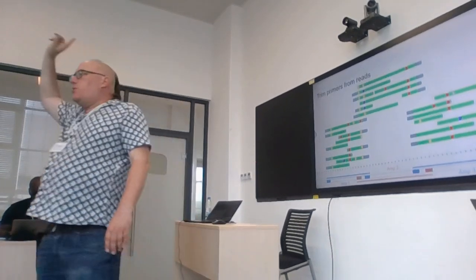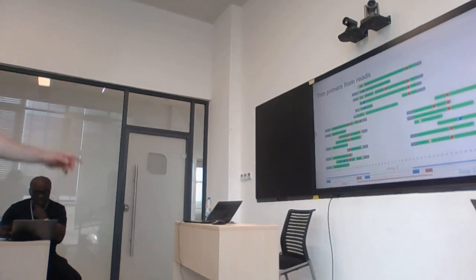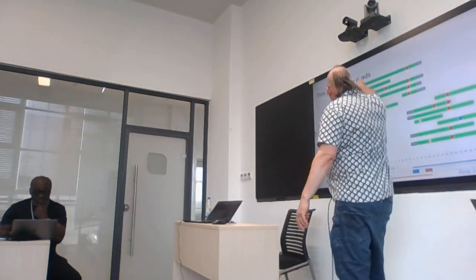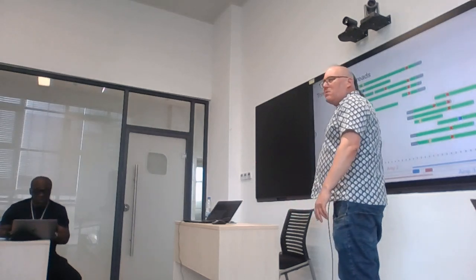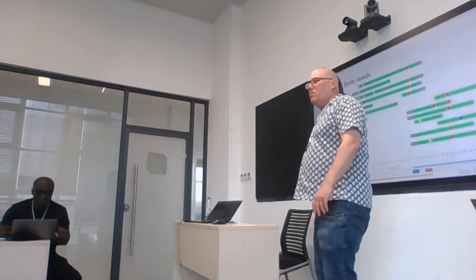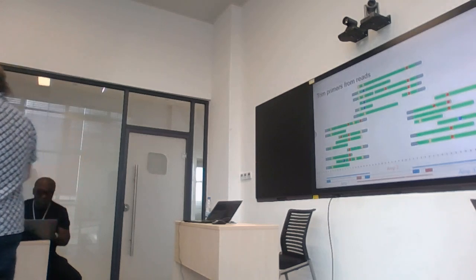Here is a picture of an alignment of reads against a reference for amplicon sequencing. Here is a not mixed site, because it's all the same variant. Here is a mixed site, which is a mixture of the blue and the yellow variant.